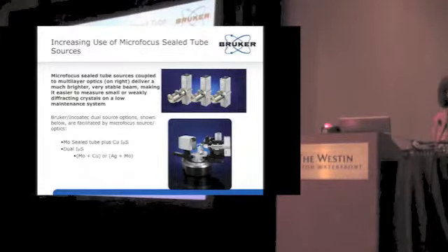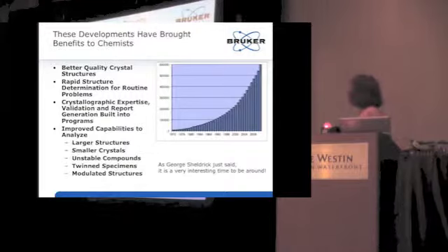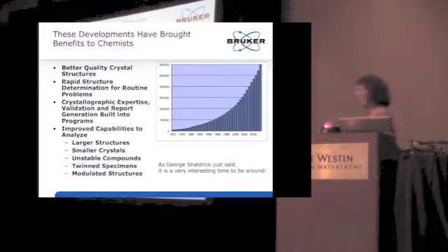And what has this done for everybody? Here's the CCDC wonderful chart from the latest website, seeing the increase in number of structures over time. What has that given us? Better quality crystal structures, as well as many more crystal structures for routine problems.